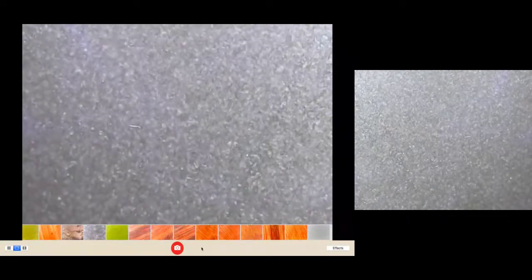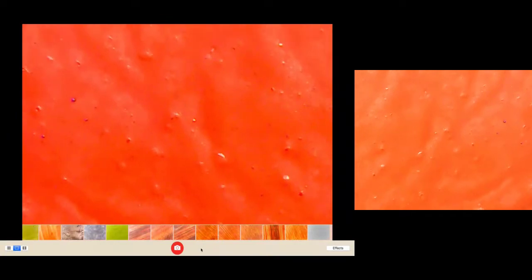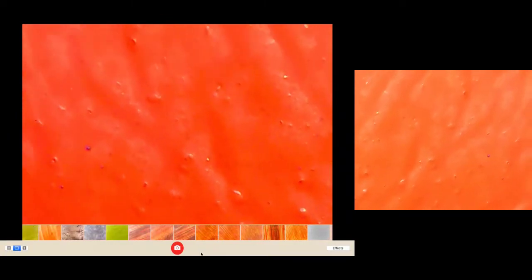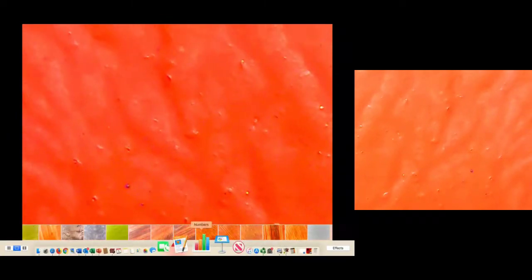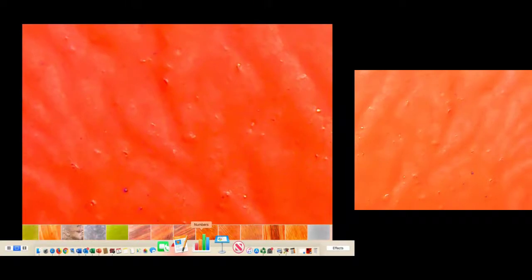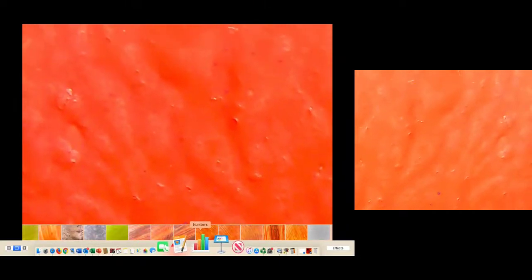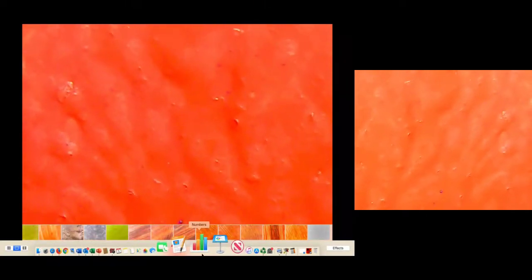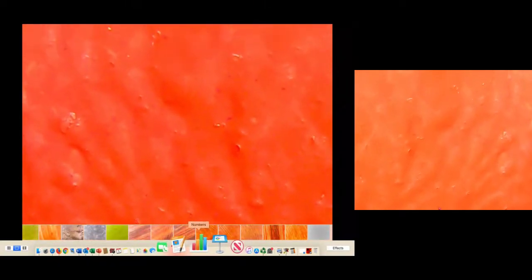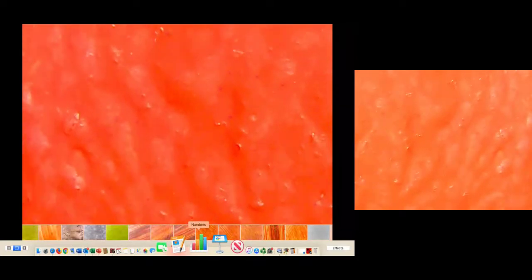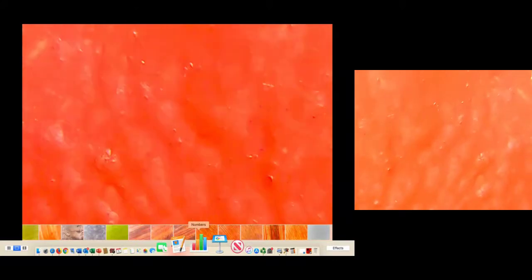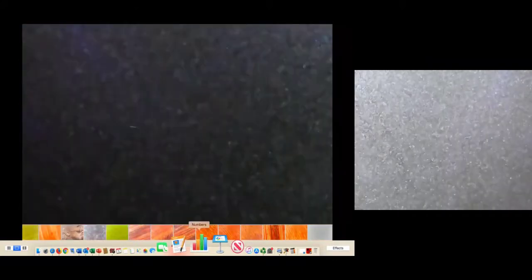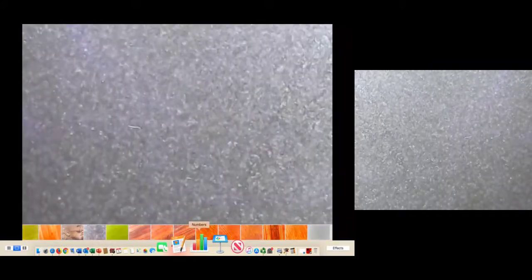So, definitely we can see a difference with the addition of the Aquazol. Now, here's another one that has had it added. And oh yeah, there's a definite difference. And I guess I should have a control so we can see it before and after application. But there's a definite difference and we have reflectance spectroscopy. So I'll be able to determine the degree of reflection with the application of the Aquazol.